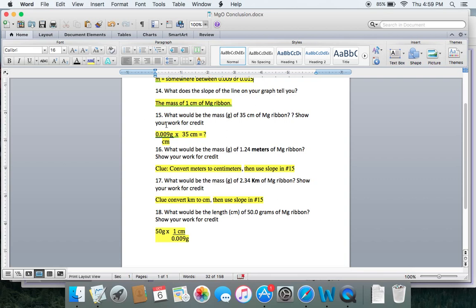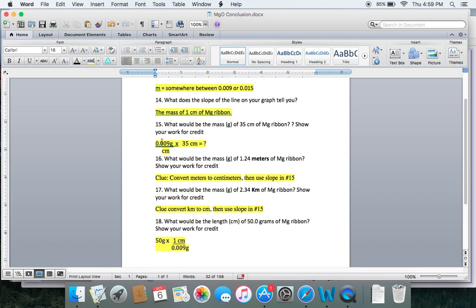So you can take that slope and do these conversions. For example, if we want to figure out 35 centimeters of magnesium — how much mass would that be? You just take your slope and multiply it by 35.